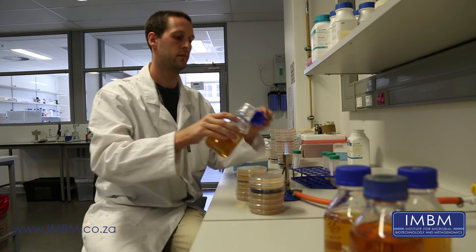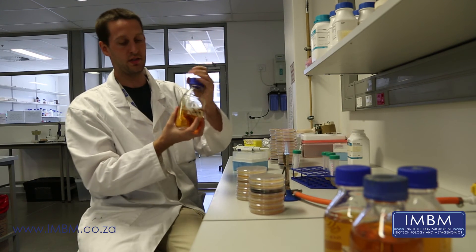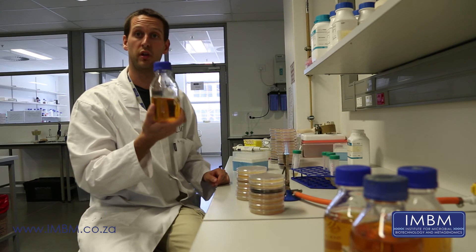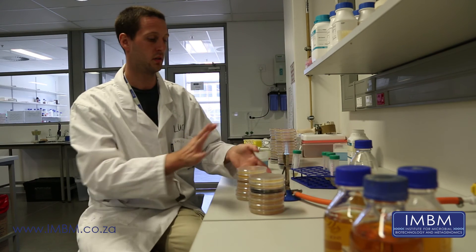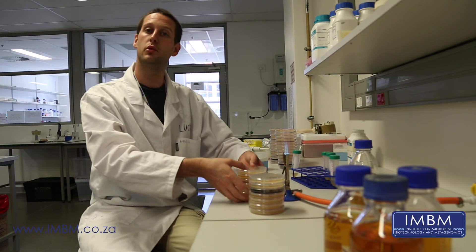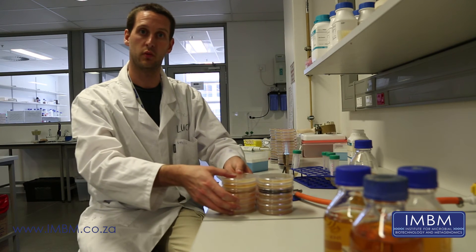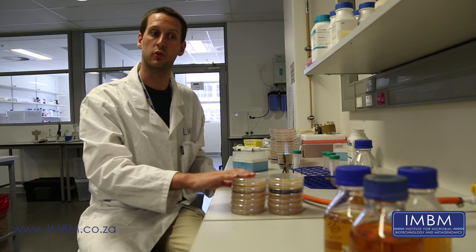Now your plates are done. Sterilize the lid again and close your bottle. This agar, because there's so much left, will have to be autoclaved to sterilize it again and then it can be disposed of. These plates can now be put at 30 degrees and incubated overnight, and tomorrow morning we will check to see whether we have any zones of clearing or not.